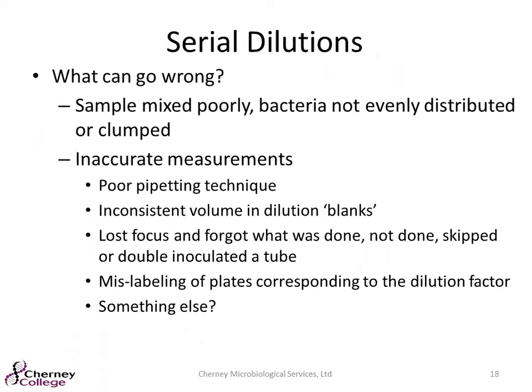So if you have to make any serial dilutions, for anybody that participates in proficiency, I know those are typically dilutions that most customers, ourselves included, are not used to typically doing. So really watching when you make those serial dilutions, because so many different things can go wrong. You can not mix it properly, so not shaking it, letting it sit again, or you can have poor pipette technique.